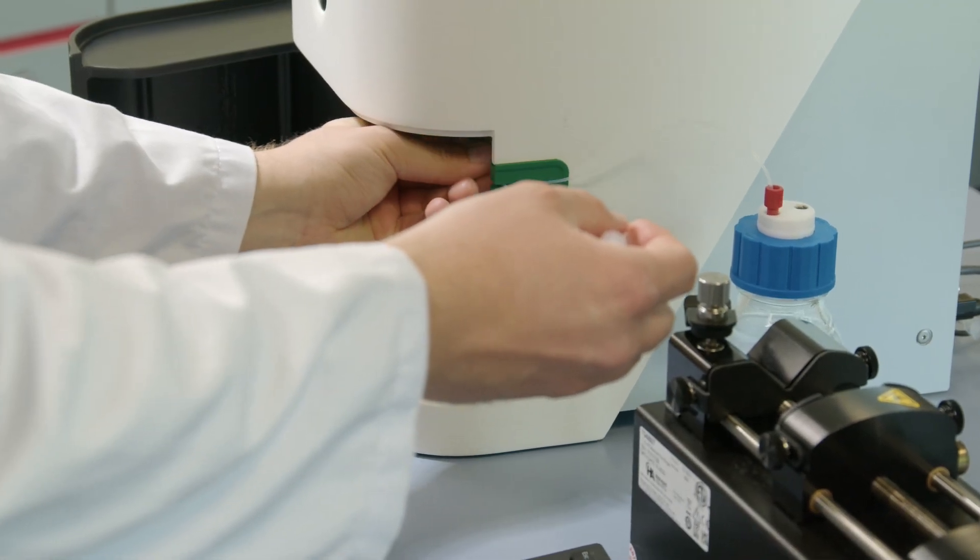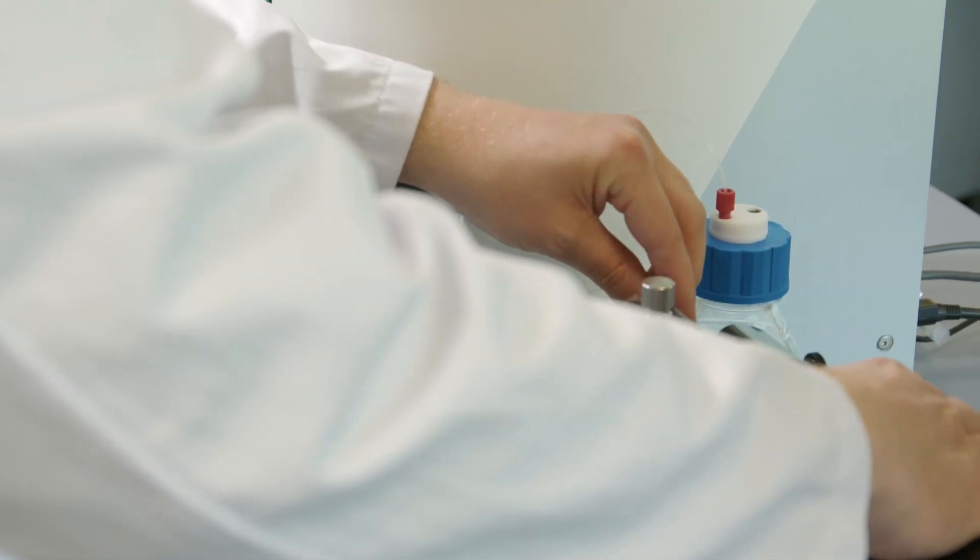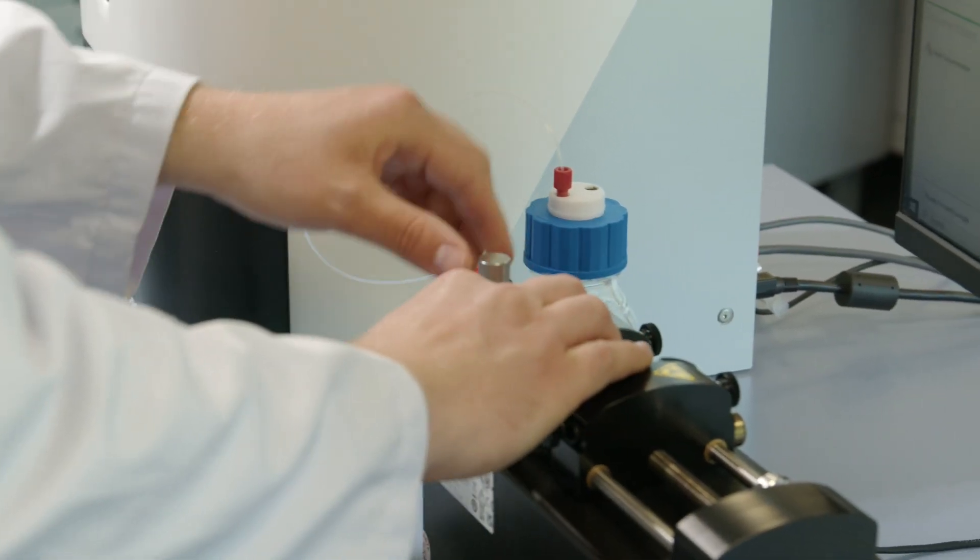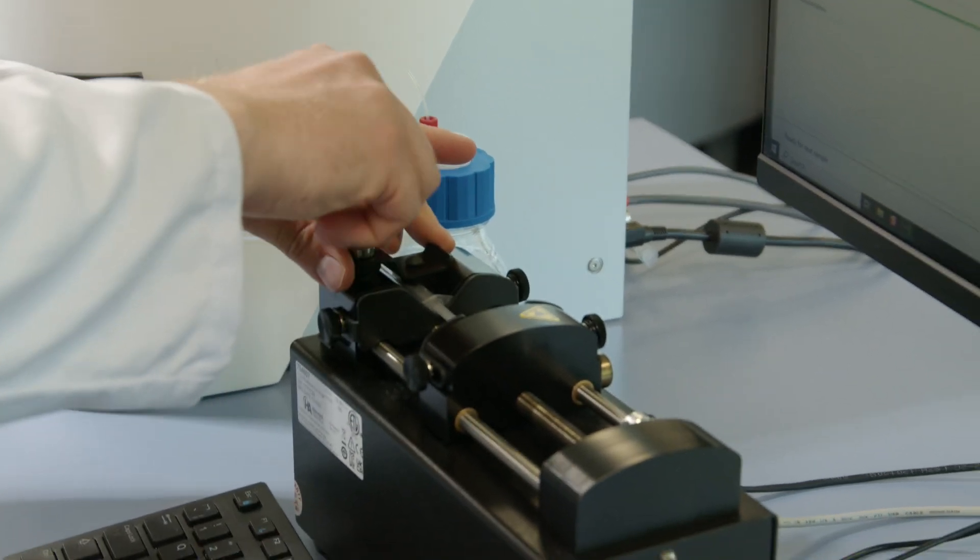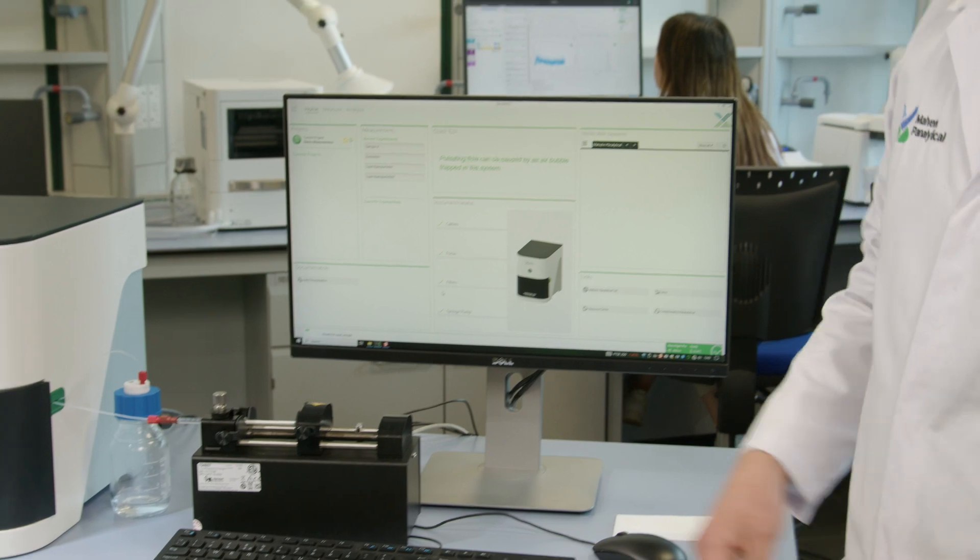Then we just put our tubing into the catch, close the door. Now the syringe goes into the syringe pump so we just need to adjust that, put the syringe down and then lock it in place. Now that we've finished setting up the sample it's all ready to measure and we can move on to the software.